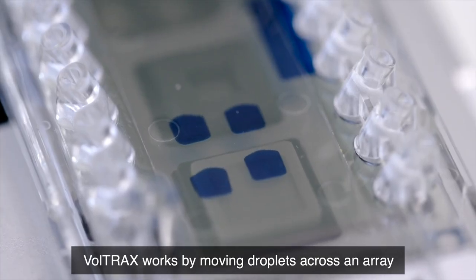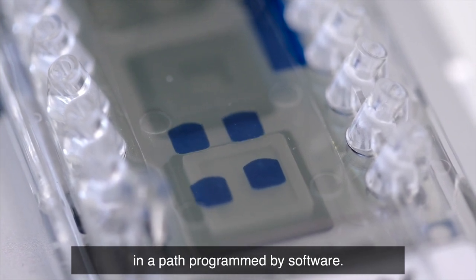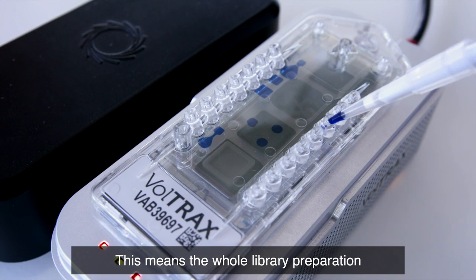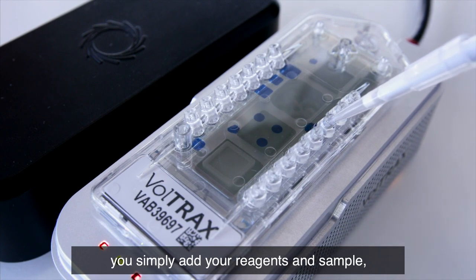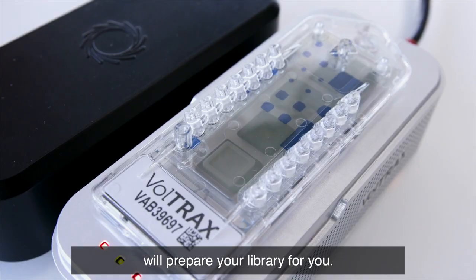Voltrax works by moving droplets across an array in a path programmed by software. This means the whole library preparation process is hands-off. You simply add your reagents and sample, select your program, and the device will prepare your library for you.